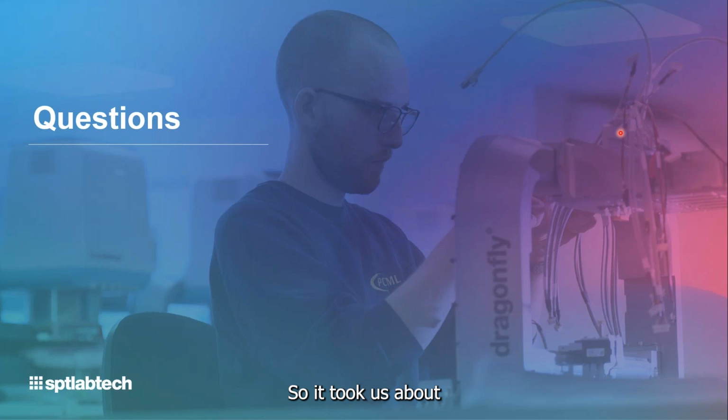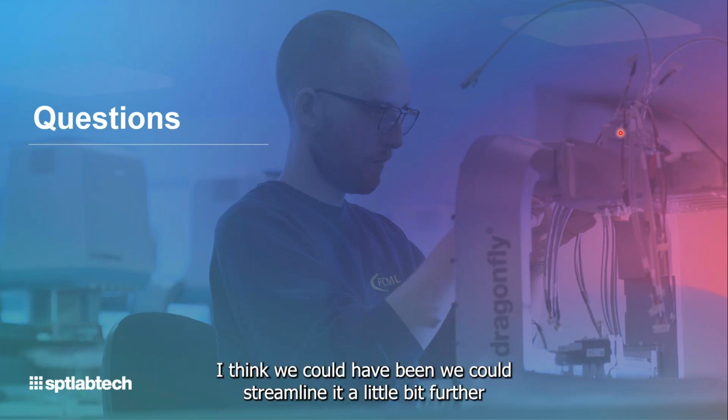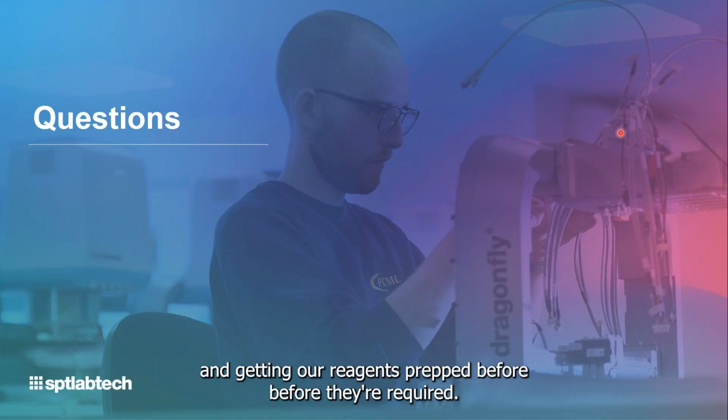So it took us about 5 hours to do the process. I think we could streamline it a little bit further if we're a little more efficient with our user interactions and getting our reagents prepped before they're required.